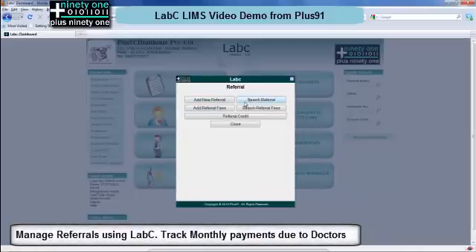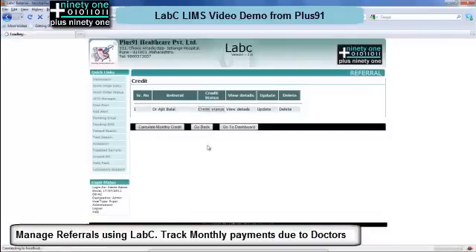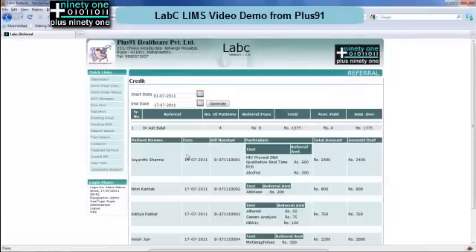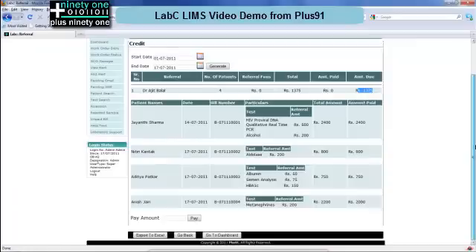Next is the referrals module. You can add new referrals and add rate lists for referrals. For every referral you can see a credit status of how many patients they have referred and any amount due to them. You can also export this to Excel.